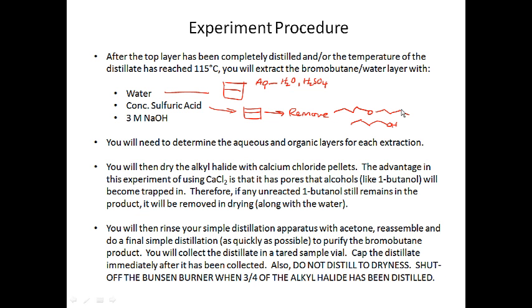Okay. Now, what is the 3 molar sodium hydroxide there for? So we separate those two layers. Well, after you separate those layers, you're going to have, hopefully, butyl bromide.